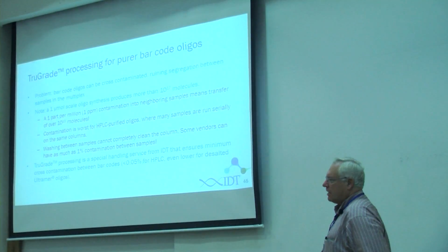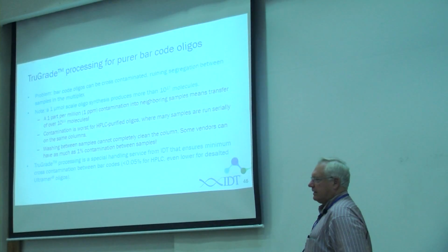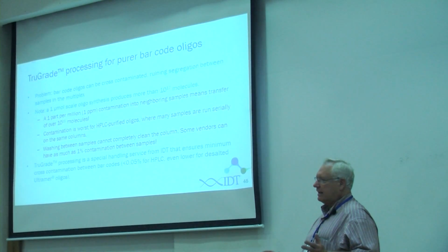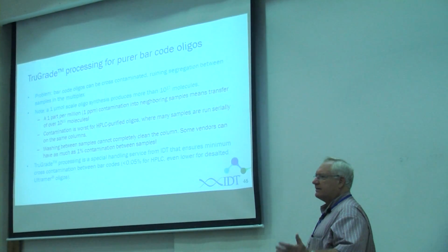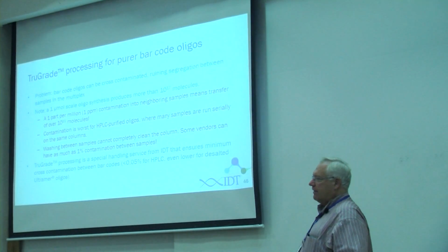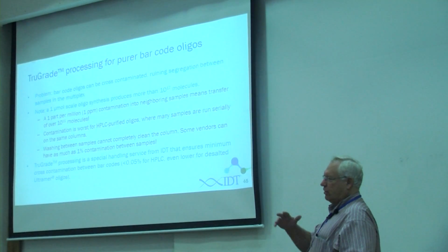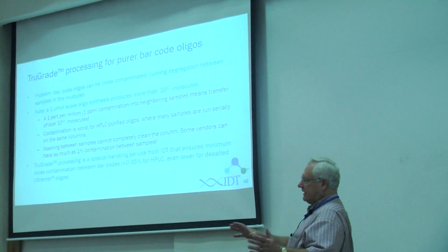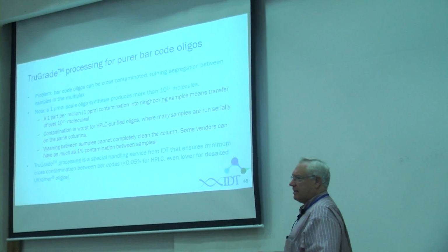And the biggest problem about NGS adapters today is cross-contamination. And it's something that people don't like to talk about. But here's the cold hard reality: if we make a reasonable scale synthesis reaction, there's 10 to the 17th molecules in that synthesis. If you have 1 part per billion contamination between preps in a lab, what's 10 to the 9th into 10 to the 17th? That's 10 to the 8th molecules of contamination. That's a lot of contamination.